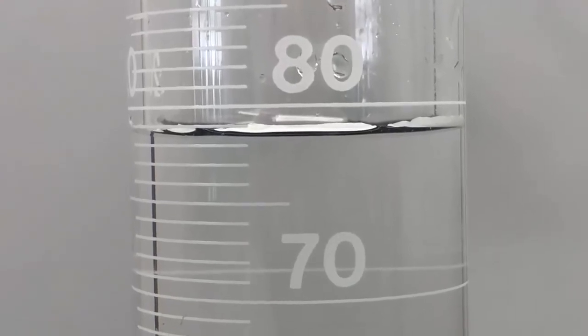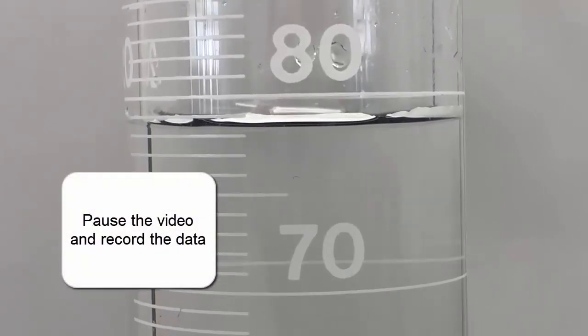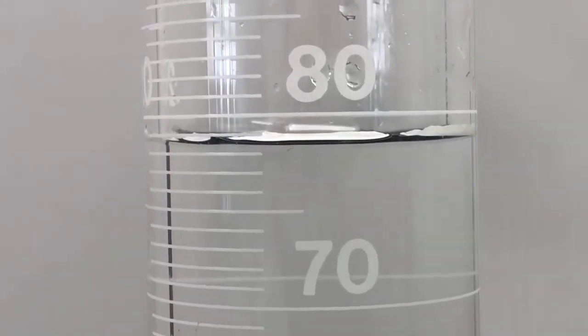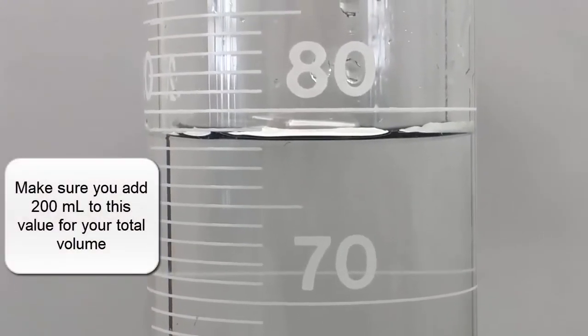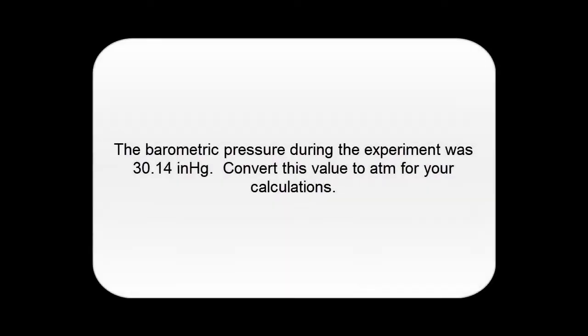I moved this to a place where it's easy to measure. You can see that it's just below 80 mils, so you can record that as your data. Before this, I used a small pipette and funnel to fill this up twice, so that's 200 plus this value. The last bit of information you need is the barometric pressure — I had to look that up online. When we did this experiment, it was 30.14 inches of mercury as reported on the weather website. You'll have to convert that value into atmospheres to complete your calculations.